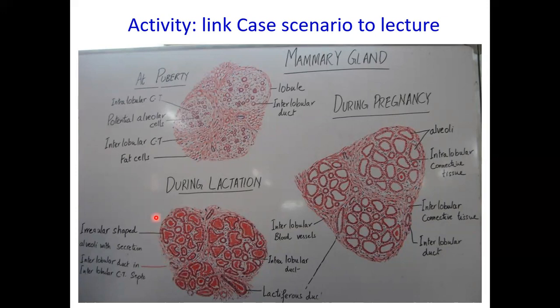After the end of lactation, her mammary gland returned to normal, and she used to go to the campaign of mammary gland check-up to assess her mammary gland condition. This is why the mammary gland undergoes many microscopical changes due to hormonal changes, either during rest, pregnancy, and lactation.